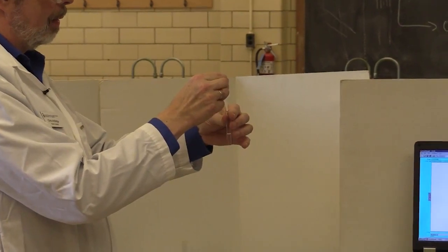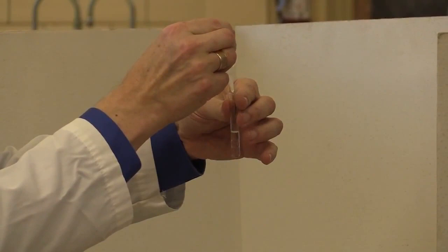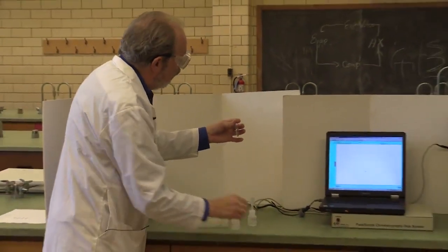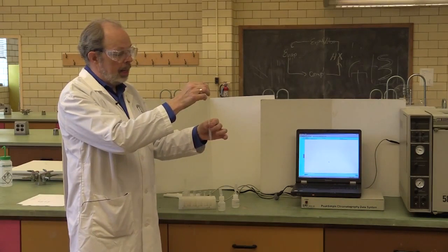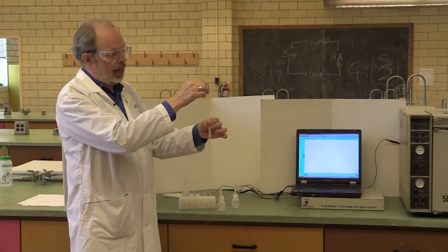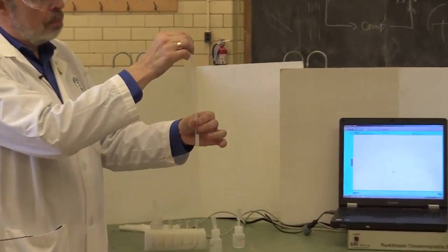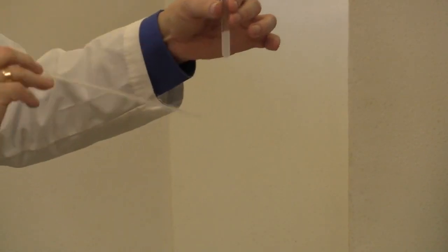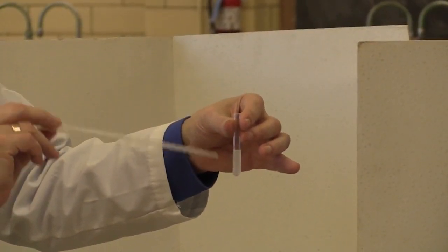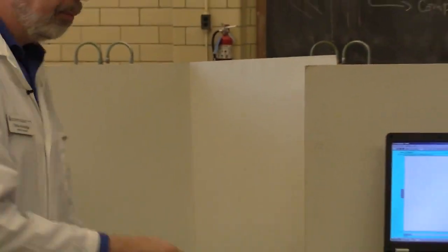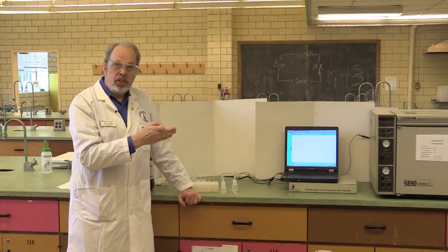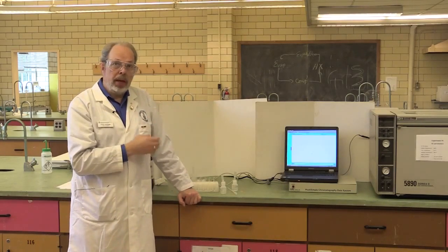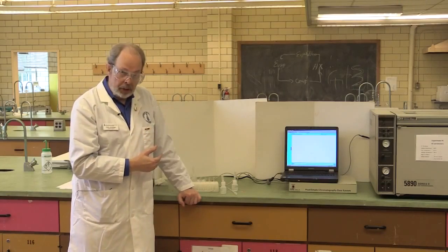[Counts to 30 drops of methanol]. All right, now, that has resolved into two phases, but they haven't mixed. So, take a plastic dropper and suck the entire contents of the tube into the dropper and shoot it out and do that a few times. And that will cause it to mix closely and when it resolves again, right now it's gray, but when it resolves again into two phases, the system will be at equilibrium. You're going to do that for seven different tubes with equal amounts of cyclohexane and methanol and then you leave one of them with nothing else in it. The other ones, you add 5 drops of toluene, 10 drops of toluene, 15 and so on until you get equal amounts of cyclohexane, toluene and methanol.